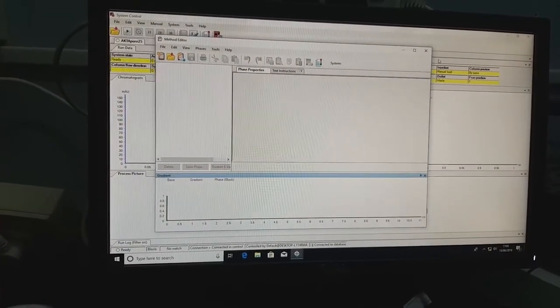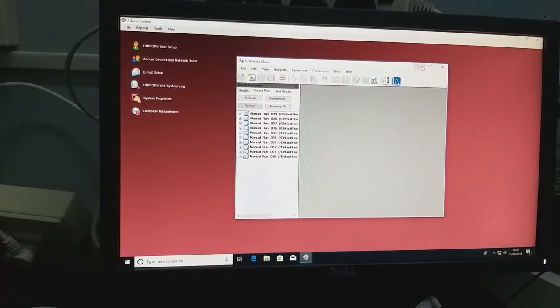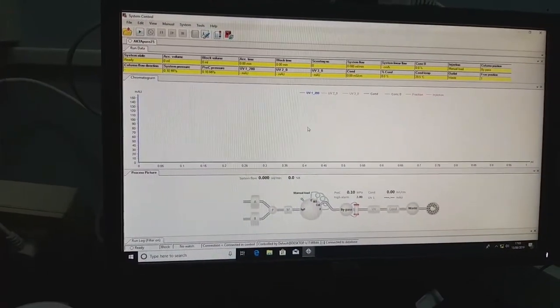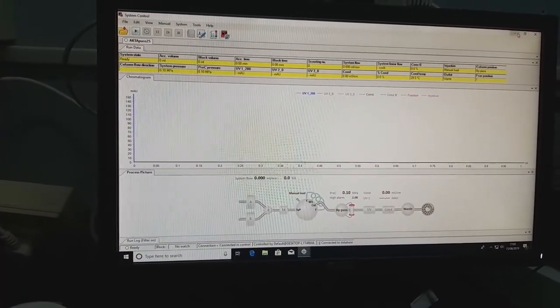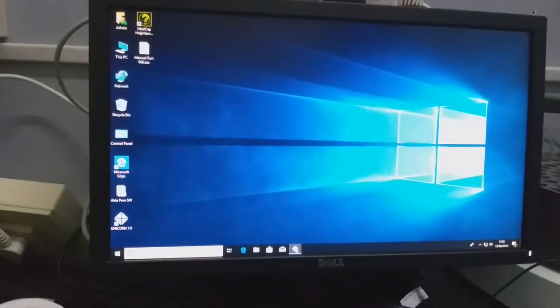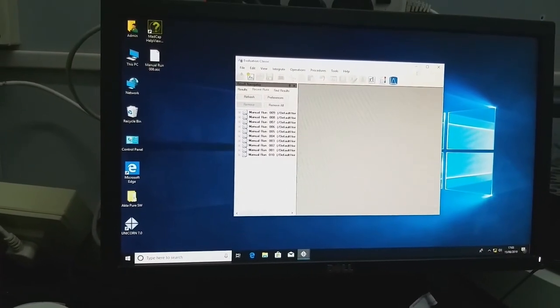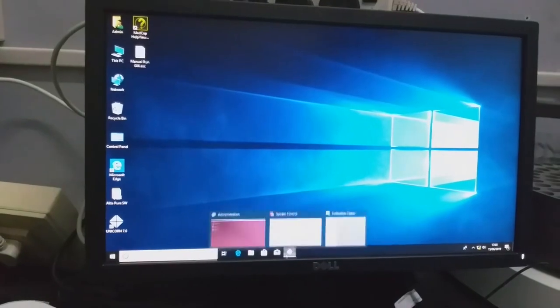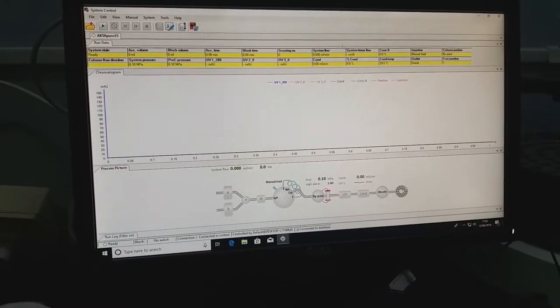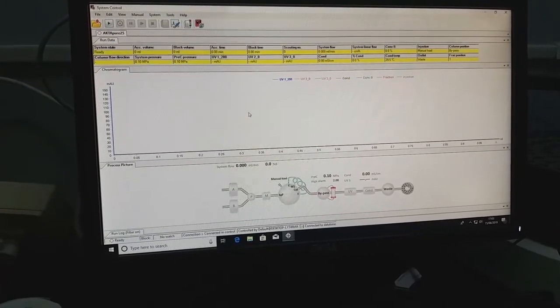The software will give you three pop-up windows. One is the Method Editor, another is System Control, and the third is Evaluation Classic. System Control is where you can see chromatograms in real time, and Evaluation Classic is where you can analyze your chromatogram. Just go to System Control first. The first thing we have to do is connect the instrument.